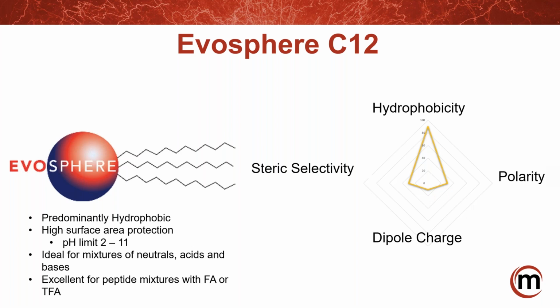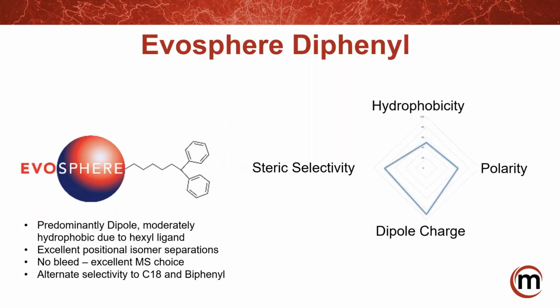But two, we've seen some really nice separations with peptides with the C12. So also as peptides, you need to do isolation purification, and we can scale this to prep. But it basically gives you hydrophobicity on the C12. My favorite chemistry here is this diphenyl.